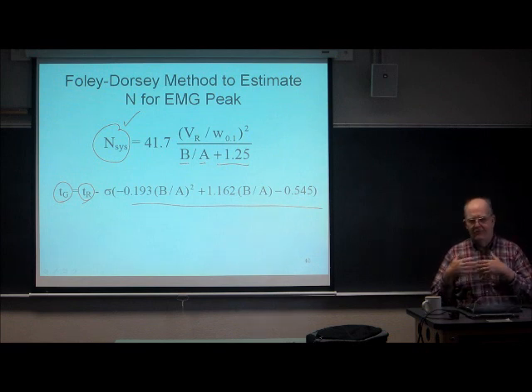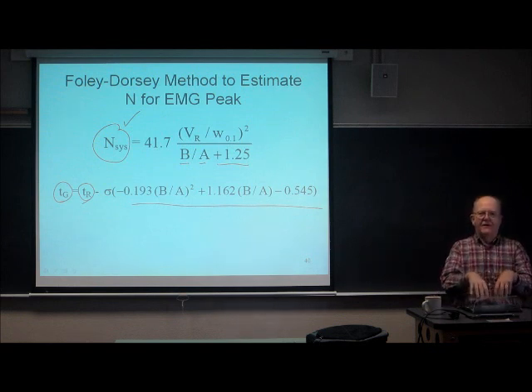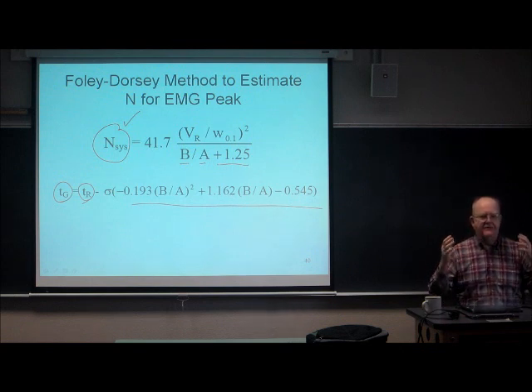And one of them could well be assume that it's an exponentially modified Gaussian, and then it's going to implement something like what I just told you about. Another option that you can pick on most data systems is you can say, just calculate the peak moments. That's all I care about. Just give me the first moment and the second central moment, and I'll calculate my plate counts myself.